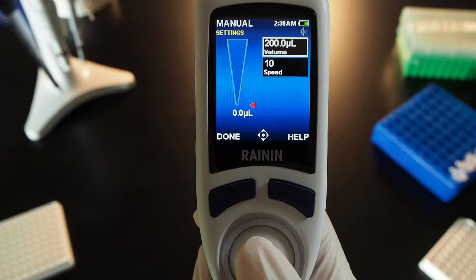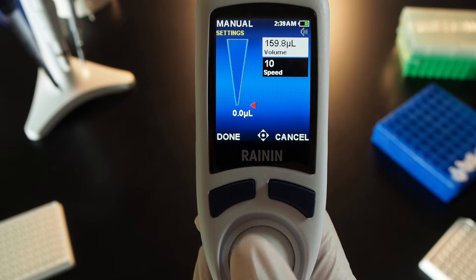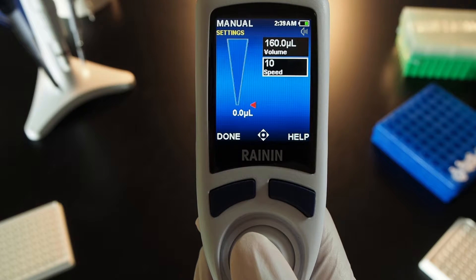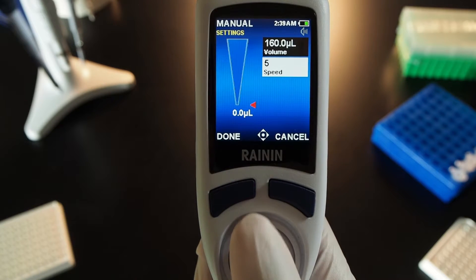The volume box is lit — press the joystick in to make changes. Left and right adjust by 10 microliters; up and down adjust by 2 tenths. Press the joystick in to set. Move down to speed and press — both aspirate and dispense use the same speed in manual mode. Left and right decrease or increase it by five; up and down by one.